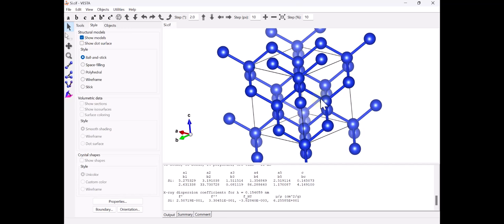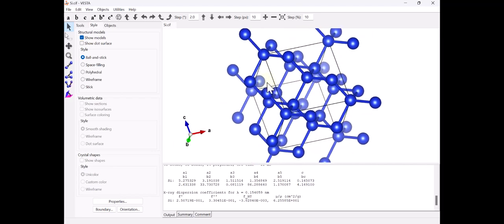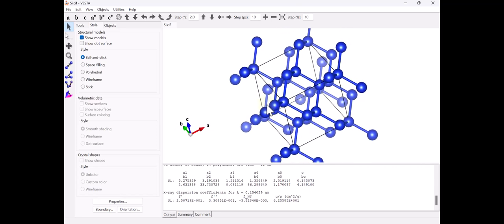So it may take a few attempts at finding a good CIF file before you find one that looks like this, where I have the full symmetry of the unit cell represented in the unit that I'm working with here. So that's just a cautionary bit of wisdom: if you're getting patterns that look strange, make sure you're not working with a reduced form or primitive unit cell, as they're called. Work from the full unit cell.